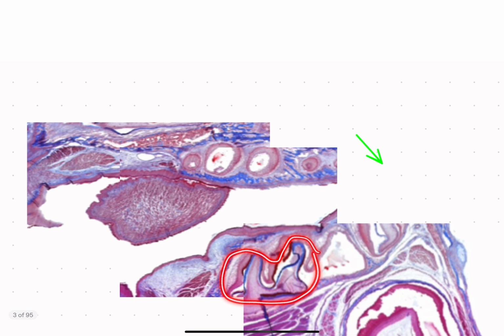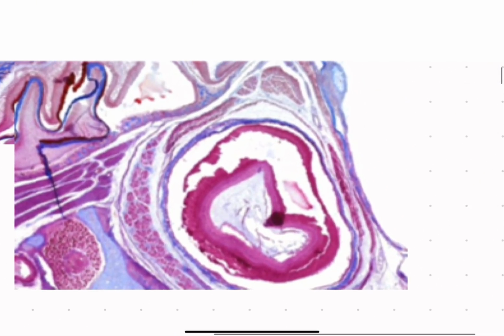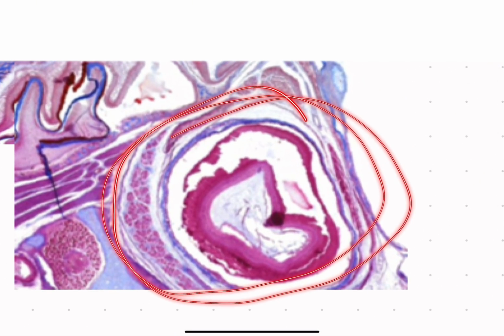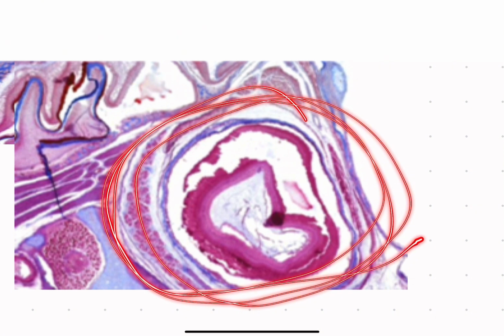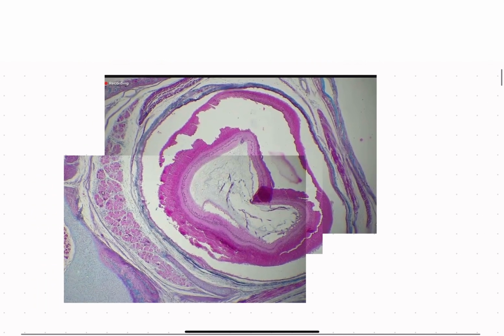First of all, I'd like you guys to identify the late tooth development. As soon as you see that with a characteristic blue dentin, you know for sure you're probably in an animal head, right? And then you can also see the developing tongue here as well. The eye is very, very identifiable in almost every slide and structure. Only here it looks a little bit wonky, and that's why I picked it out. So once zoomed in, you can see it here.